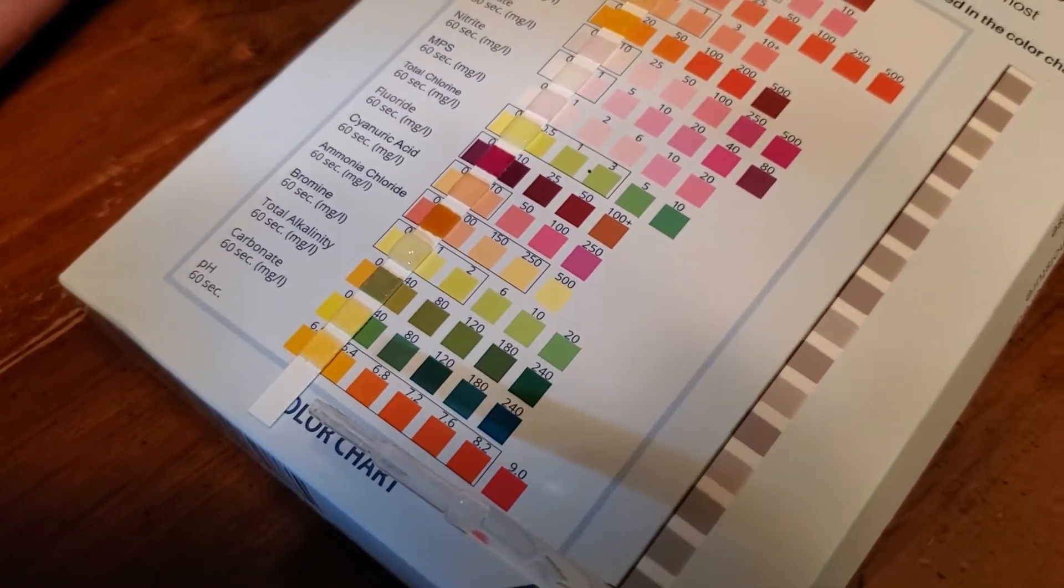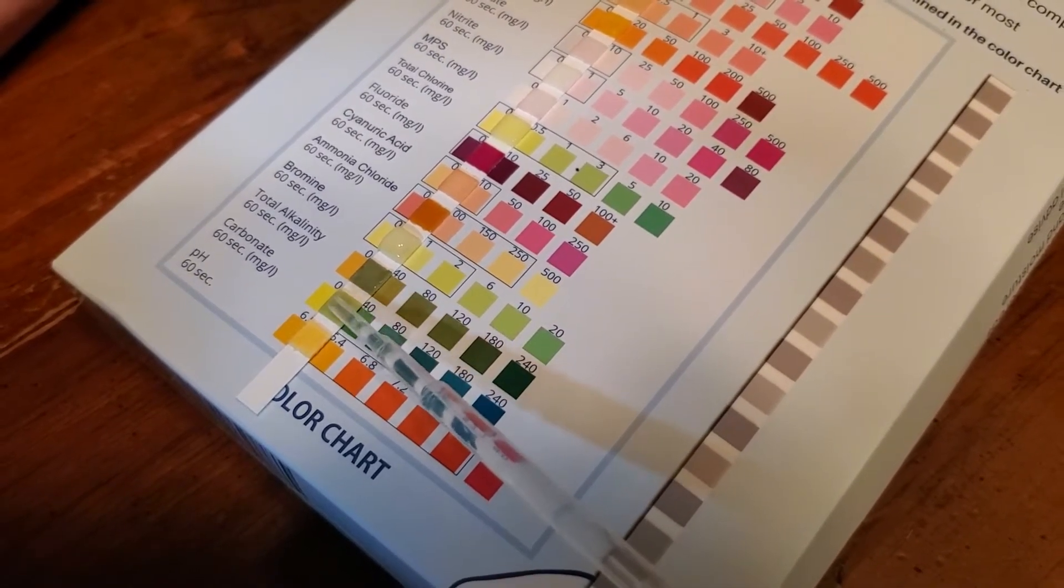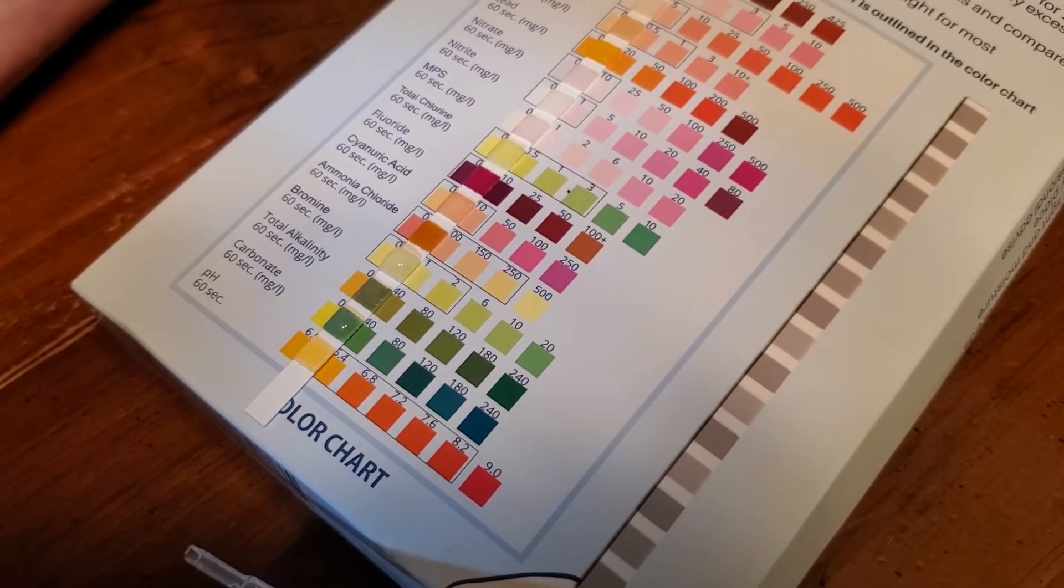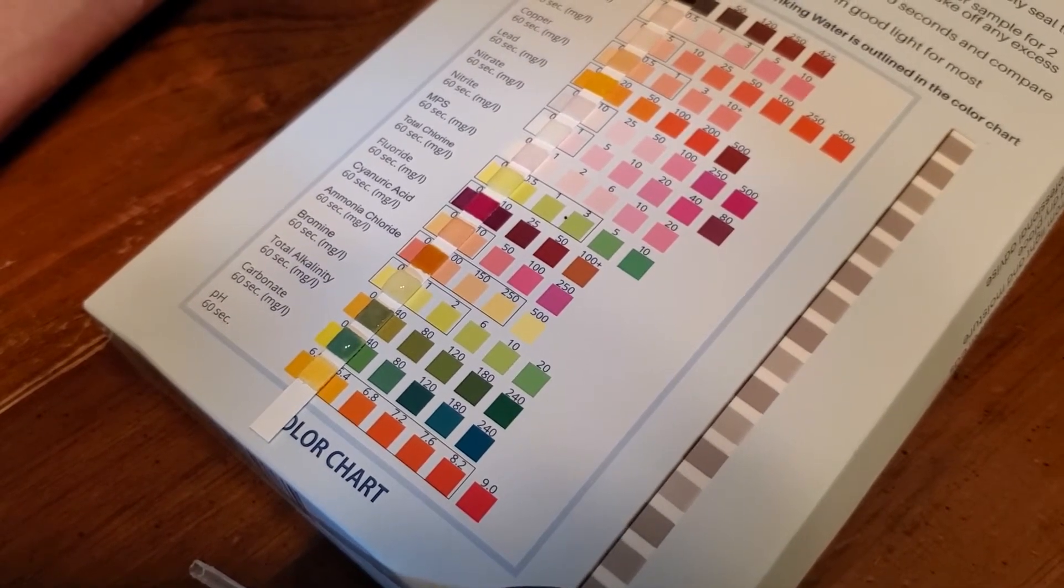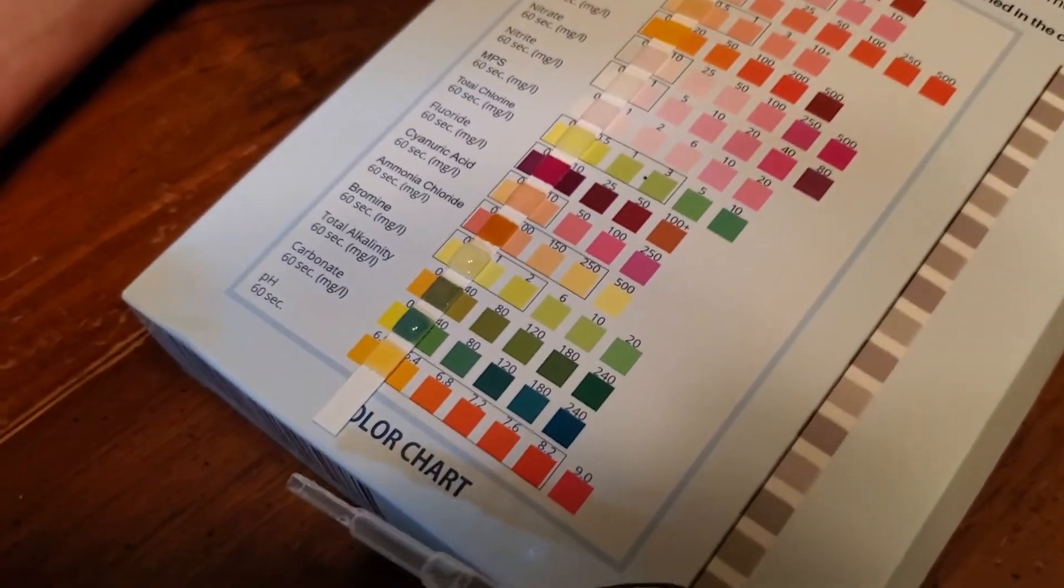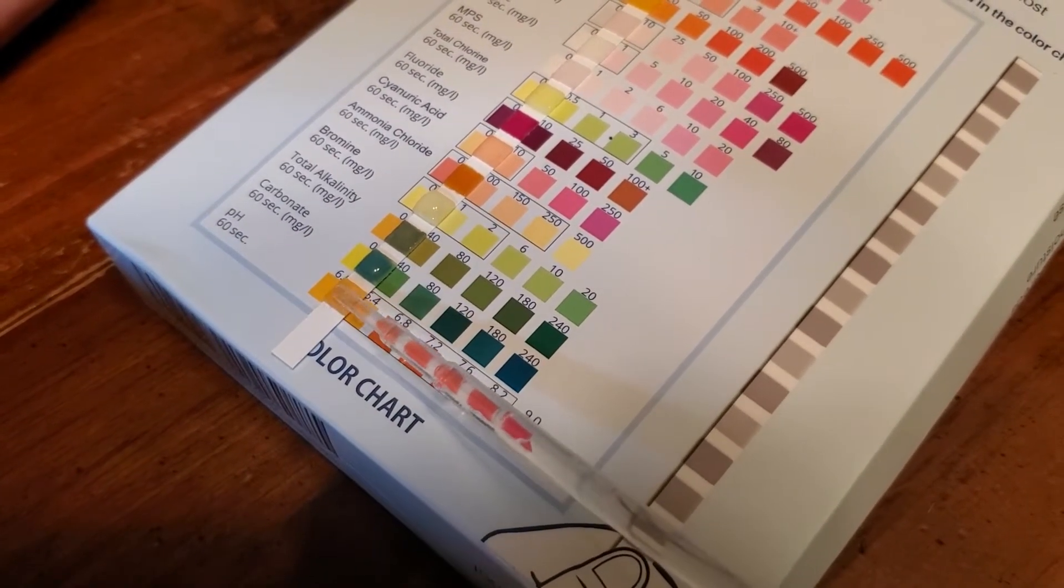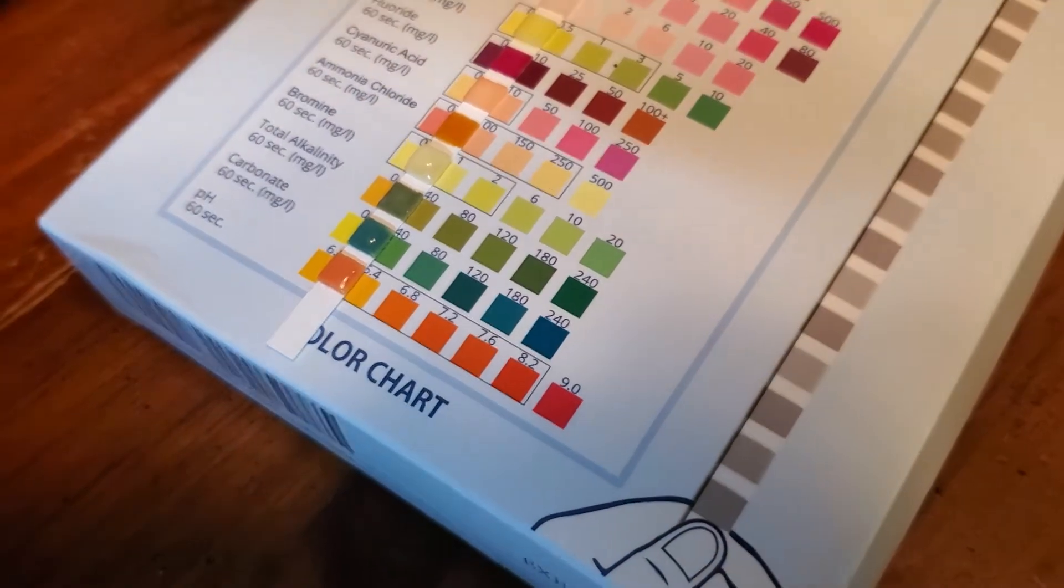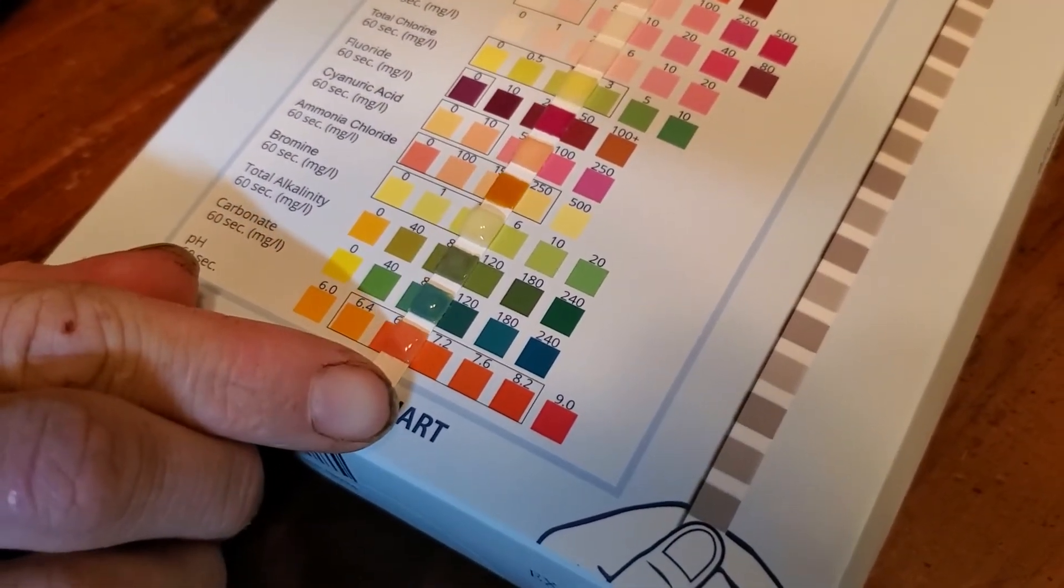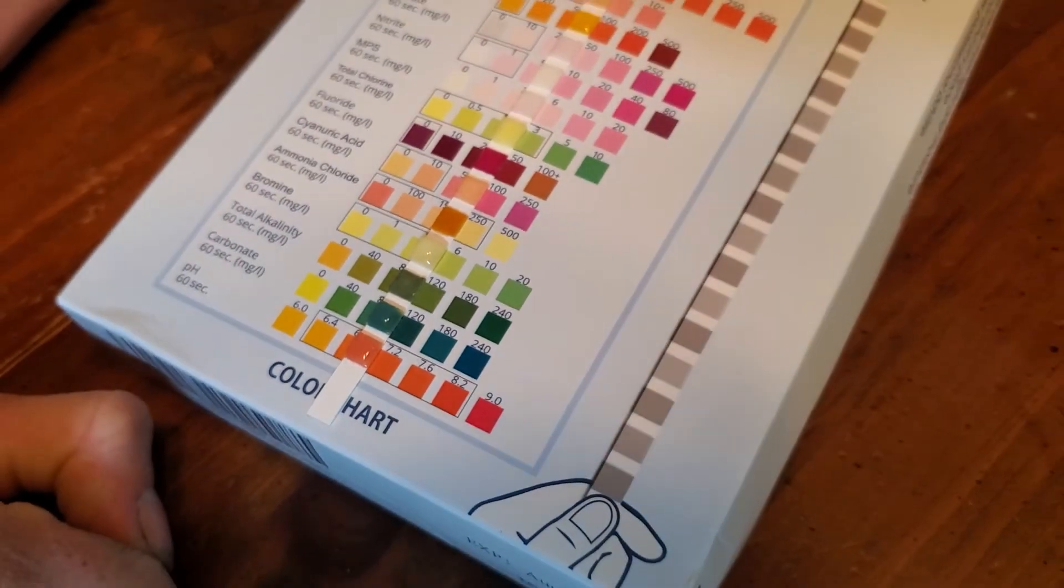Carbonate. Now see that carbonate one, that's what the lead one should look like, that's how they should do it. But I don't think they can, I think it's got to do with the specific chemical reaction dictates the colors. Wow that's a pretty shade. It is a very nice shade isn't it. It just keeps getting bluer as it goes. Very colorful test strip. Now our pH level. We have balanced pH water. Booyah!